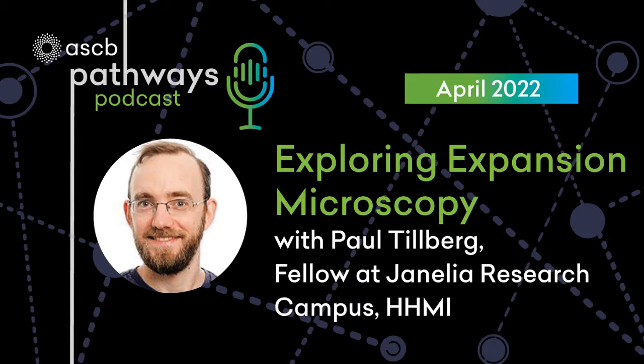Essentially, you cannot know until you check. And you have to check on a case by case basis. And so my favorite example of checking carefully on this is there's a few groups that are now using nuclear pore complexes to check the uniformity of expansion. The great thing about the nuclear pore complex is it is highly stereotyped. So for a given species or cell type, and probably also across species, the nuclear pore is basically a donut, very protein rich, with a very stereotyped structure amongst pores. And we know what the structure is from electron microscopy.